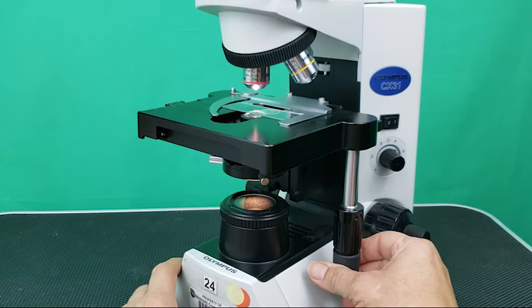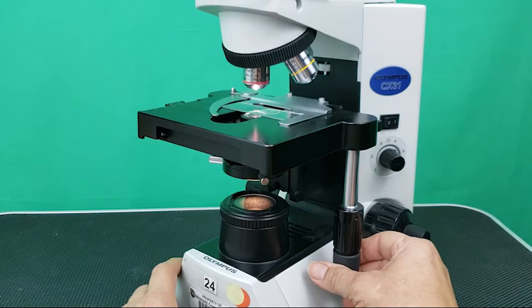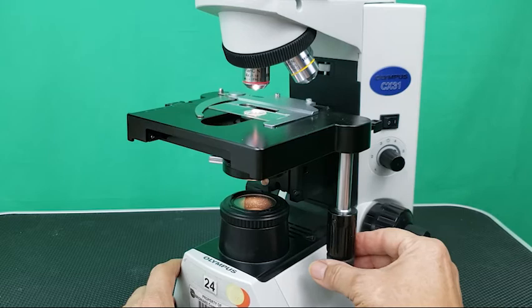If you are unable to focus the letter E with the fine adjustment knob, go back to the previous step. Again, make sure the letter E is centered using the X and Y knobs.